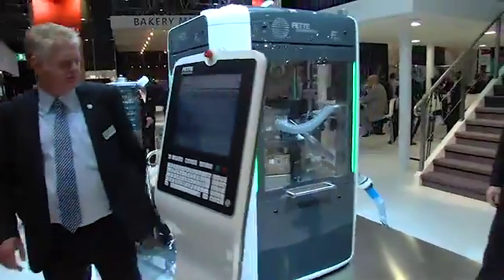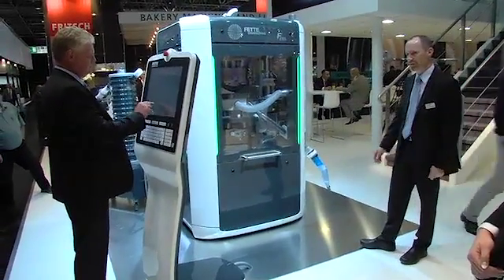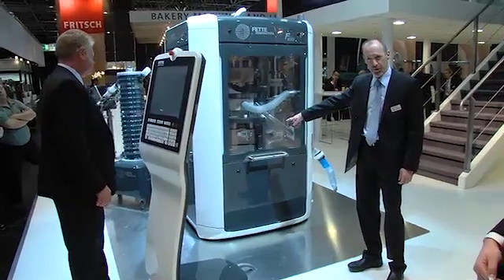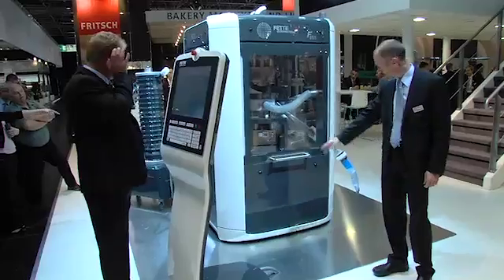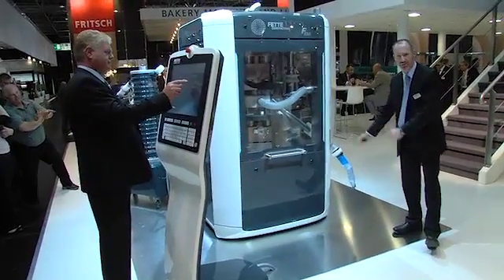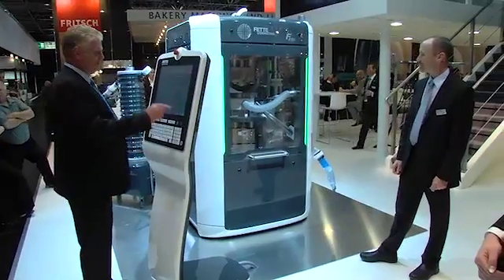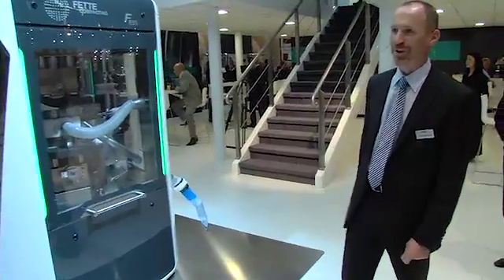As a final point, I have to sneak up on Helmut before he finishes it — if he can call for a double-layer sample. You can see how quickly the pneumatically actuated assembly temporarily increases hardness for the first layer sample, diverts it through the corner discharge for collection and or analysis. And there we are. Helmut wants to do it one more time, so there we go.